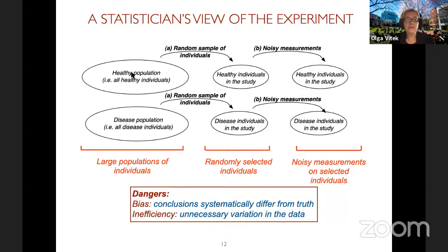And so what we're interested in is comparing the populations, but what we actually observe is the intensities of spectral peaks. And so the process of statistical inference is to take what we observe and to make conclusions about what we're interested in, which is not observed. So in general, inference means making statements about what is not observed from what we actually observe.